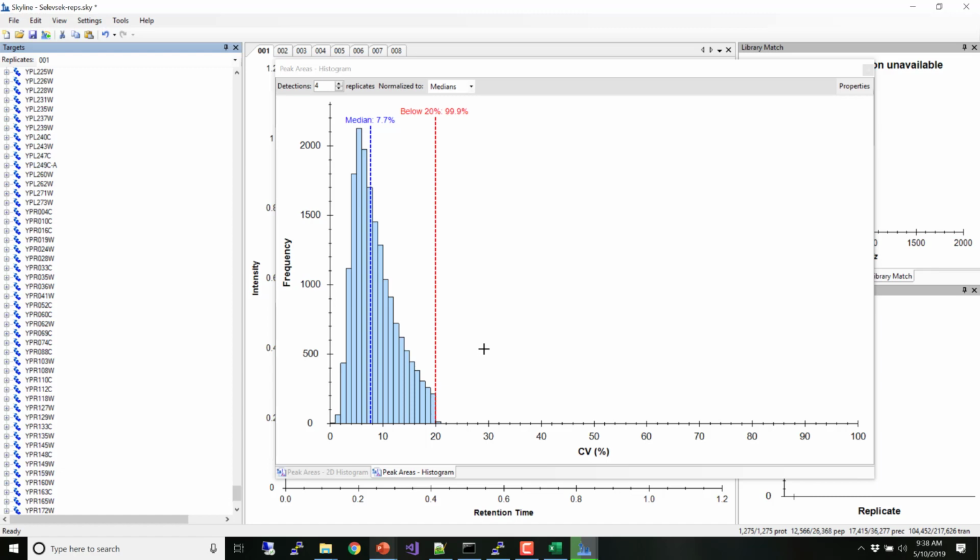The question for you is, should you run a replicate experiment to see which of the peptides in the pan-human library you can measure repeatably and reliably, or should you just throw your data at the pan-human library and let MSstats solve the mystery of what's changing and what's not? That's the question we had, and you're going to get some insight into it with Mina.